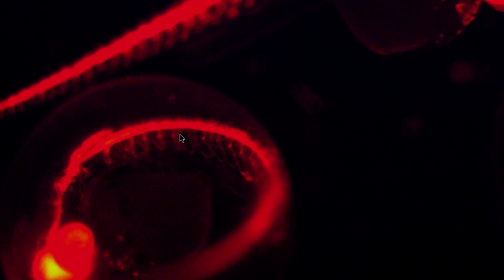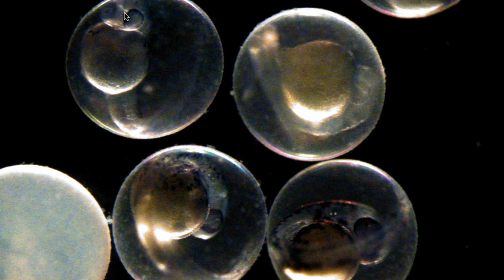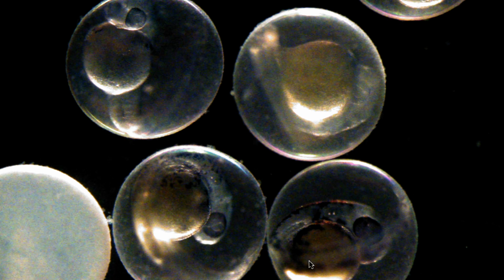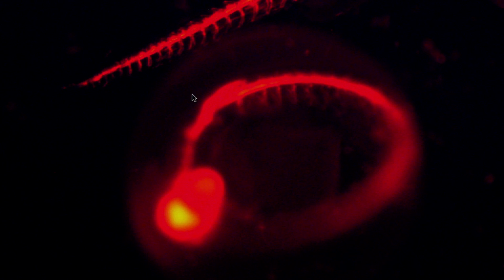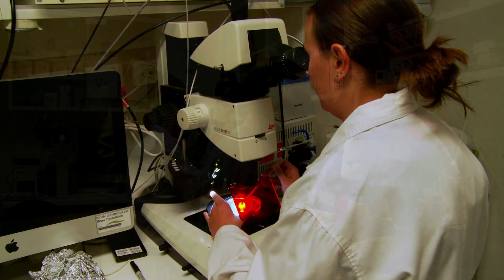Because we're able to get so many eggs and larvae from the zebrafish, this is a considerable advantage to us. So we are able to get lots of eggs and larvae from the motor neuron disease carrying zebrafish, and we can divide these eggs up and treat each group of these eggs with a separate drug or compound, and hopefully this will lead to some understanding and potentially a cure for motor neuron disease.